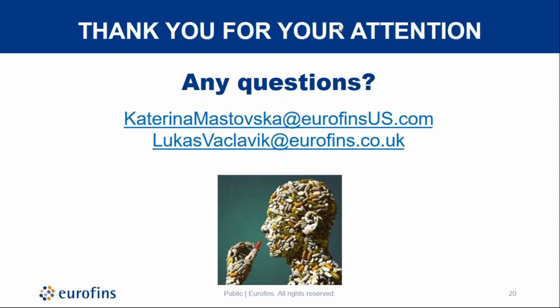Yes. Actually, Lukáš mentioned the official method for PDE5 inhibitors, which we developed to address the industry need several years ago, because PDE5 inhibitors were identified among the top high priority issues by the AOAC panel on dietary supplements. Back then, this program was supported by NIH Office of Dietary Supplements, and this was a 5-year program and ended in 2018. Within that program, there were multiple methods developed into official methods.